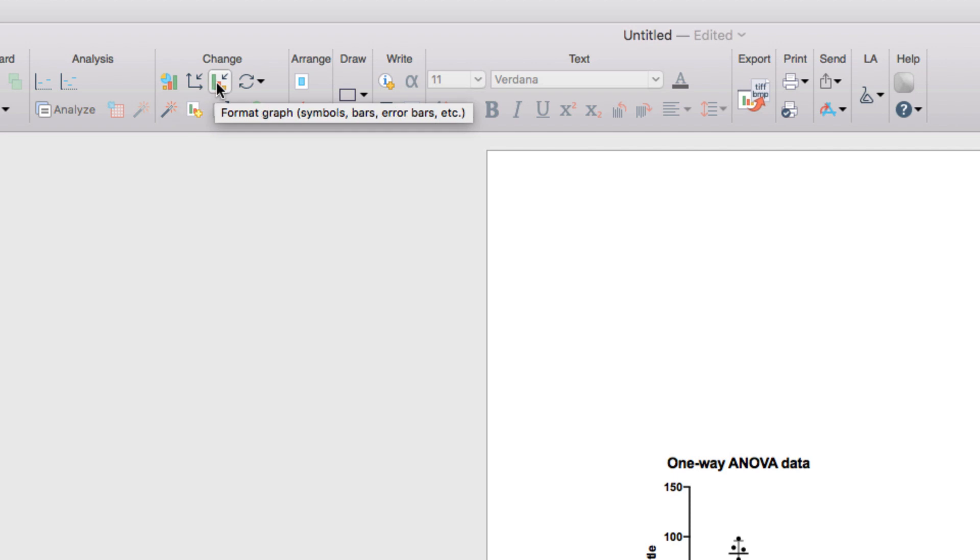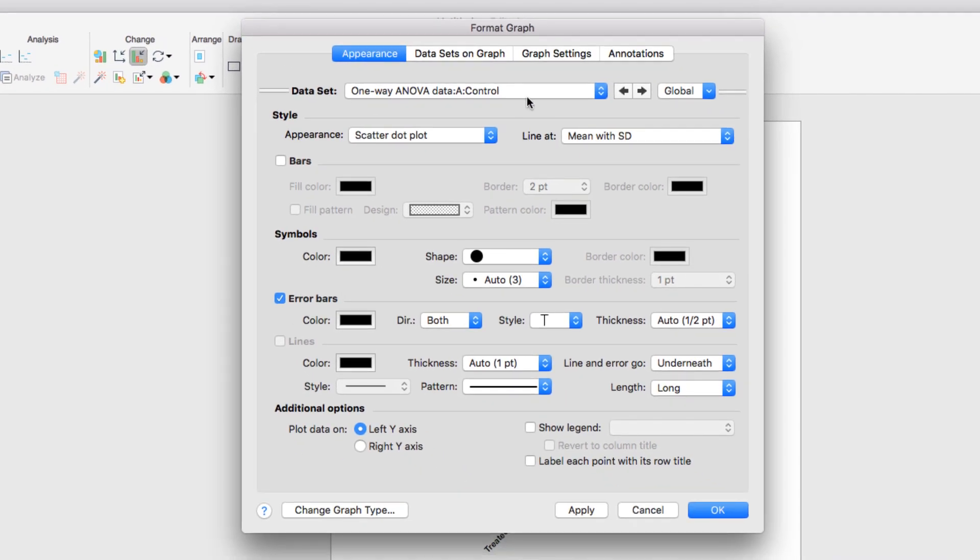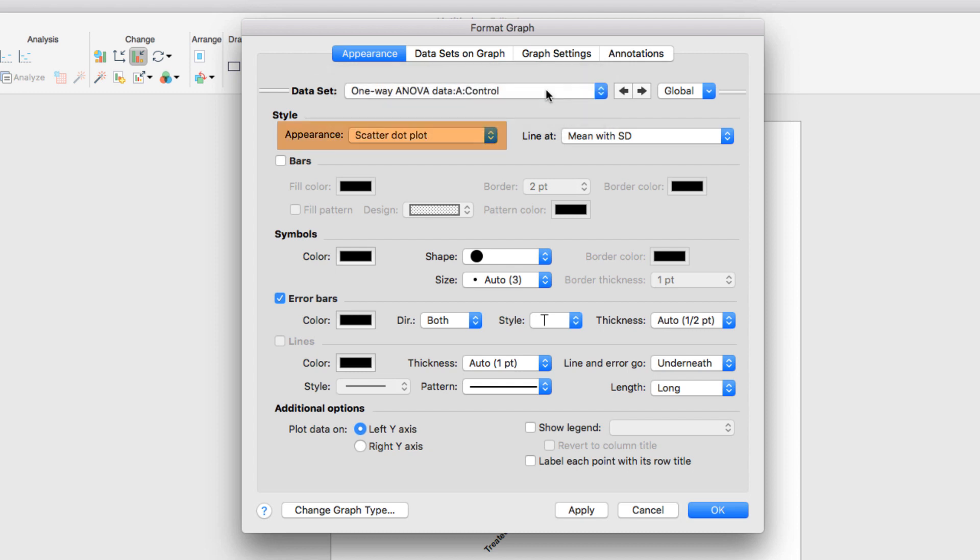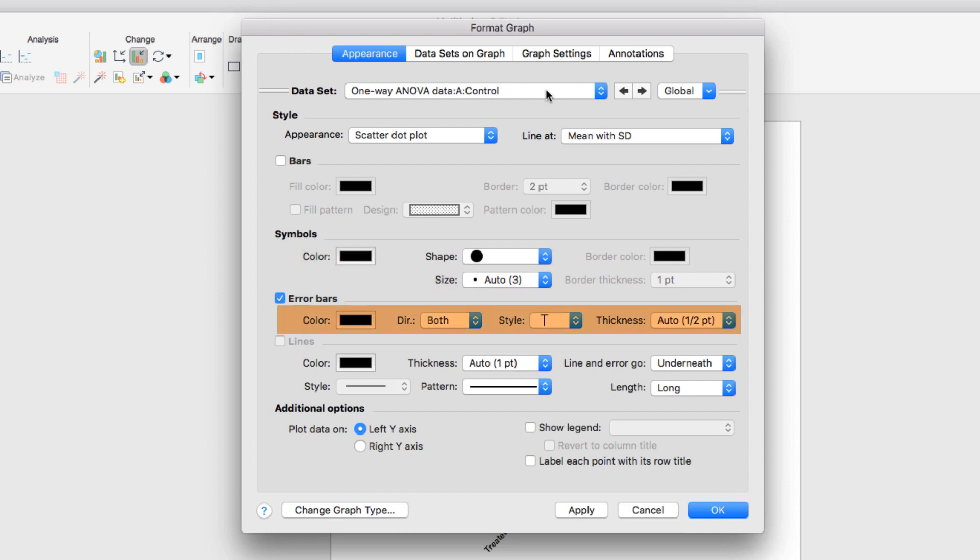The Format Graph dialog provides customization of the data sets including the symbols, colors, shapes, line weights, and other appearance options for your graph. Here you can see you can select the data set you want to change, you can select the appearance, how the line and error are shown, the color of the symbols, the shape and size of the symbols, the style of the error bars, and many other options.